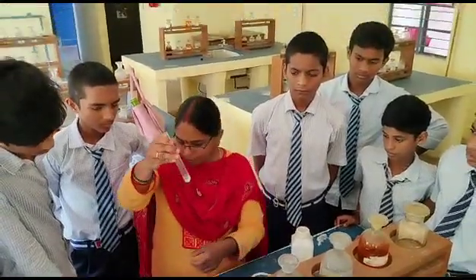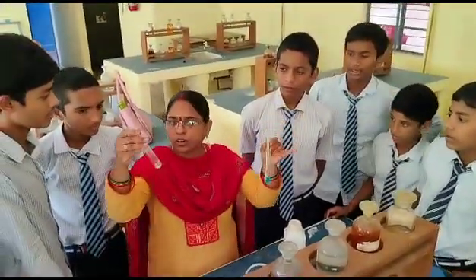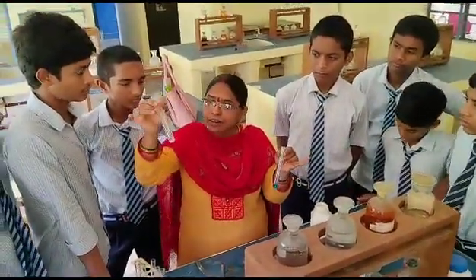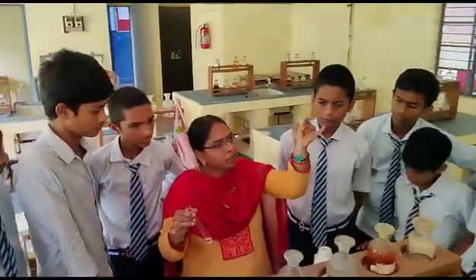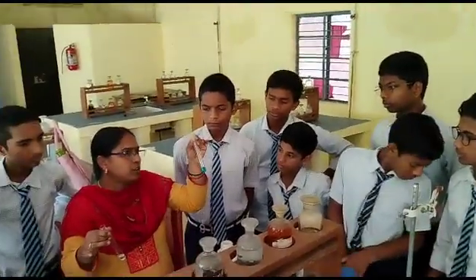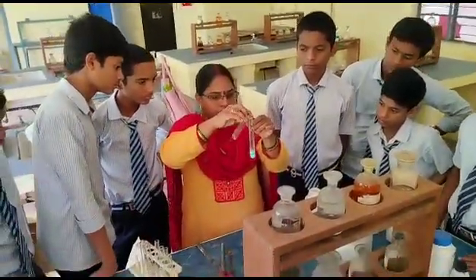Okay, so I have prepared these two. This is copper sulfate solution. Barium chloride is the reagent for identifying sulfate. So I have taken some other sulfate. Before, we had taken sodium sulfate. Now I have taken copper sulfate, and to this BaCl2 is added. Both are in solution form.